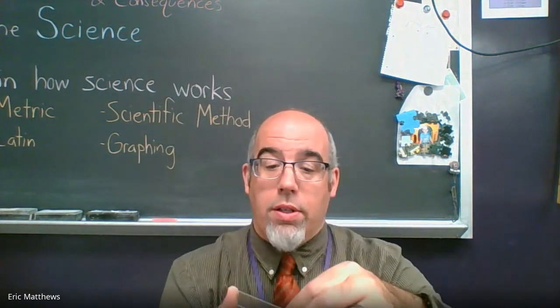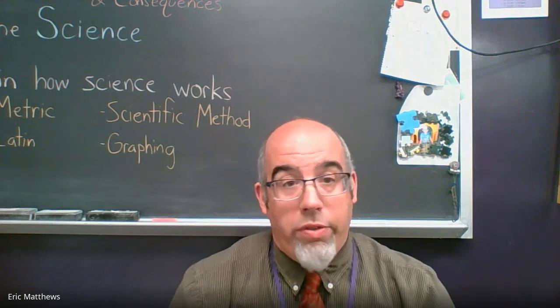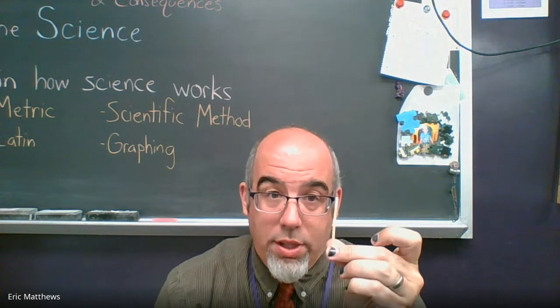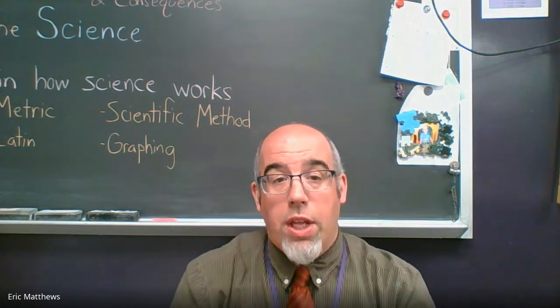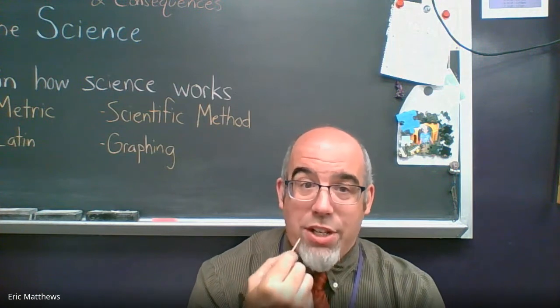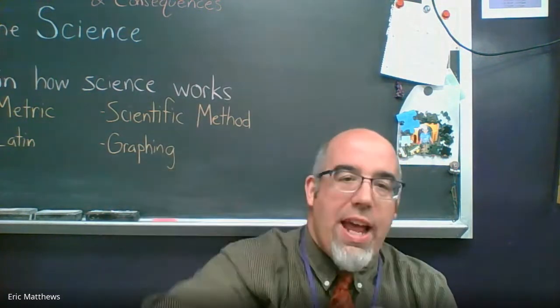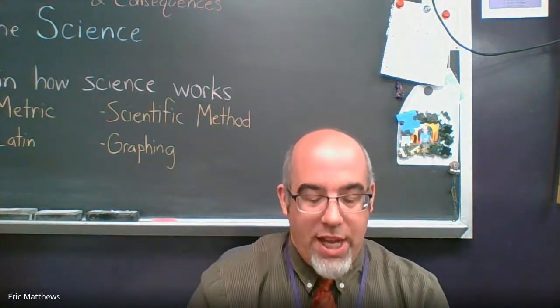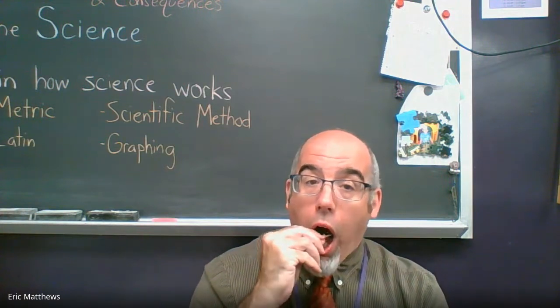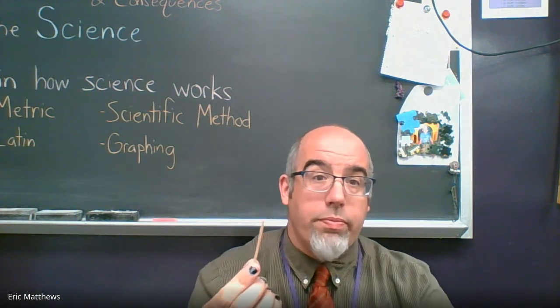All right. So from here, we're going to do a very simple wet mount. You're going to take one of the toothpicks that is sitting on your table. And what you want to do is rub this along the inside of your cheek, inside your mouth. Don't crank it up and down along the epithelial cells on the inside. We just need gentle, small movements. So basically, there we go. That's going to be enough.